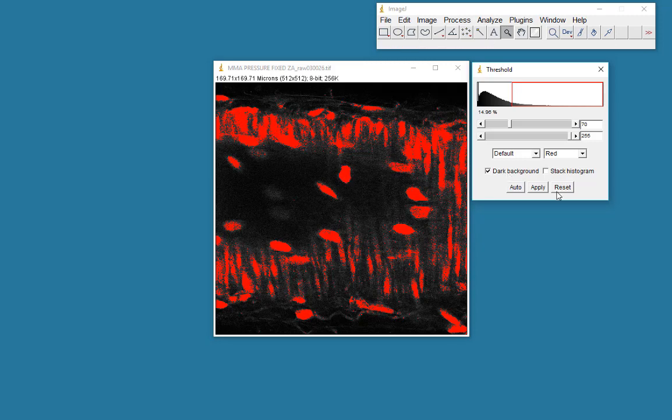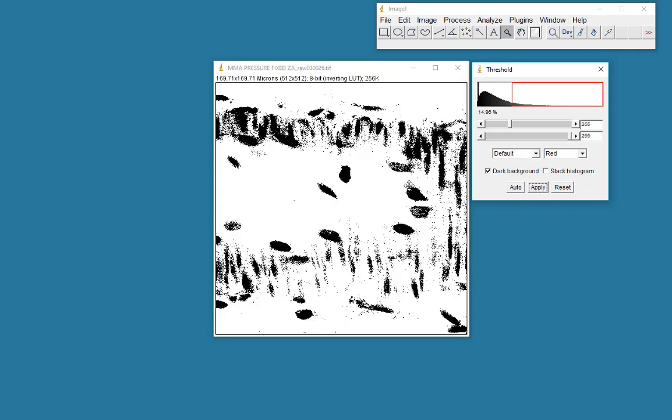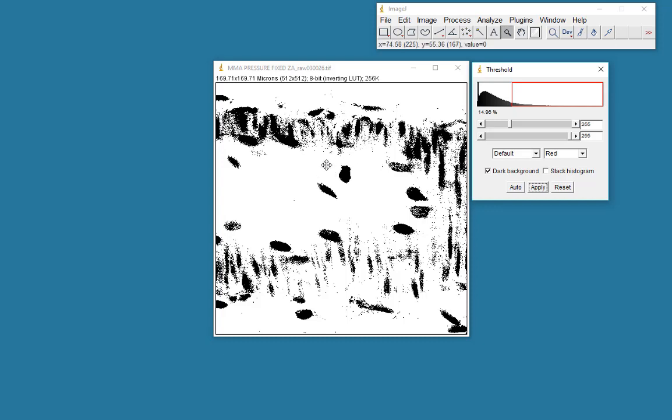I would then choose apply. And I've now created a segmented binary image. Binary image in that the pixel is either white or black. And black is what represents the selection.